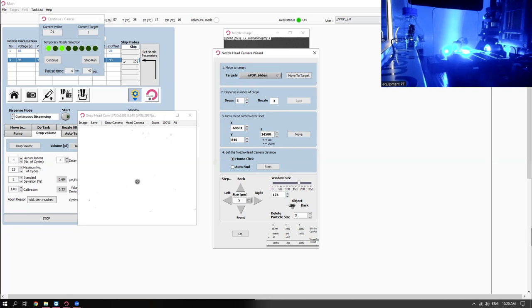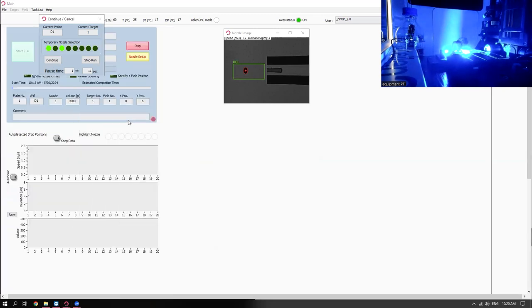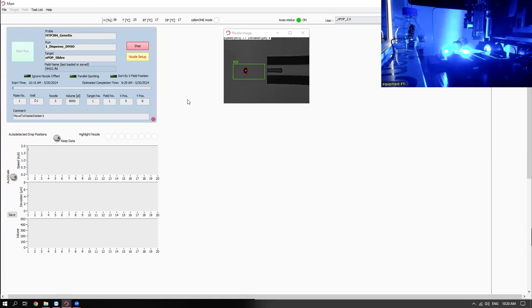Okay, there's our DMSO droplets. You can see it's a little bit different than the water droplet in terms of how it starts absorbing in the area around it, either DMSO or water. And here's that offset. We say set. Okay, so now that we've got everything set up, we have stable droplets with DMSO, and we've got our head camera and nozzles all coordinated. We press continue. It's going to wash out the DMSO, and then it's going to take a fresh aliquot to start doing its lysis buffer dispensing.